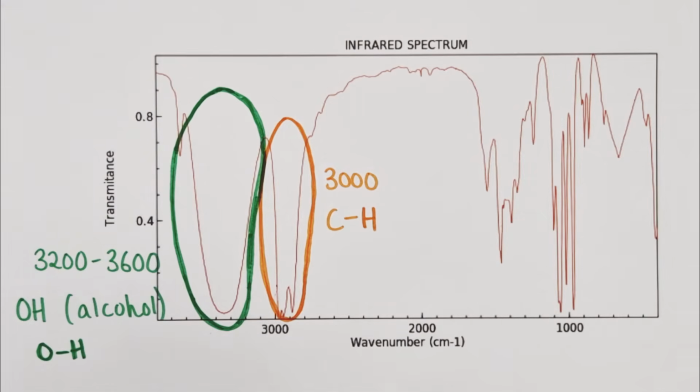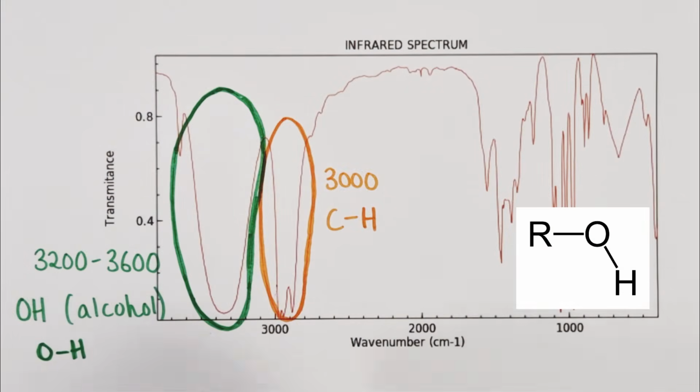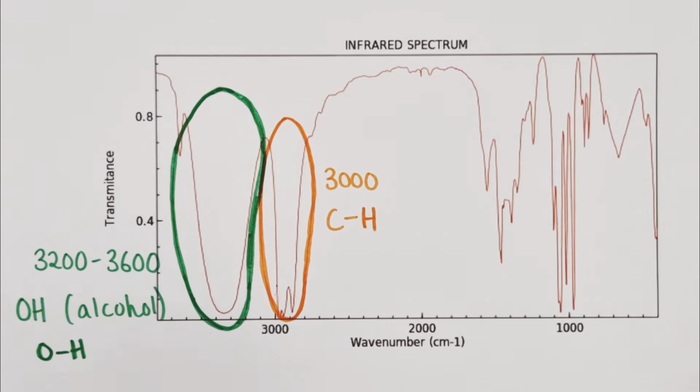So looking at the evidence we have here, we have CH bonds, we have OH bonds. This molecule is most likely to be an alcohol. There are no other troughs to identify anything other than alcohol for this particular example. Let's look at one more for the road.